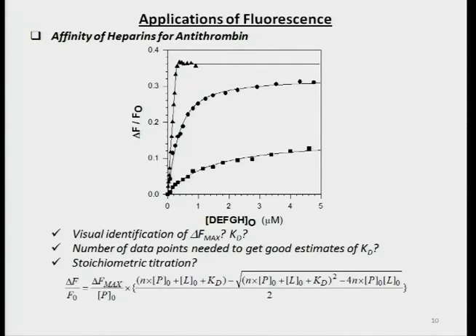The difference in the electrostatics of these two states changes the intensity because the heparin binds. Or if this probe is bound here, because of heparin binding something happens to the structure. Now the probe twists, and that changes the quantum yield. It could be either, so we may not exactly know what is actually happening. Is it that fewer probe molecules are binding, or is it that a reorientation is happening? We may not exactly know.